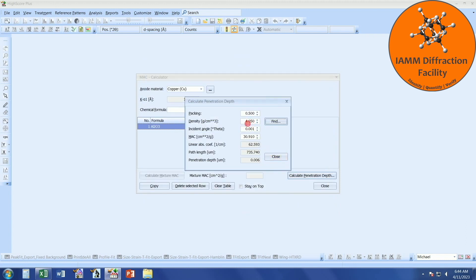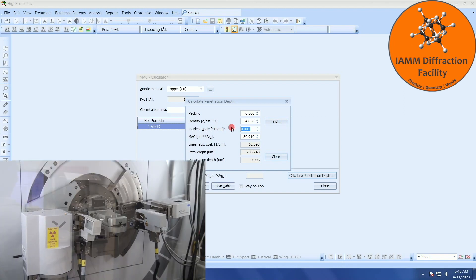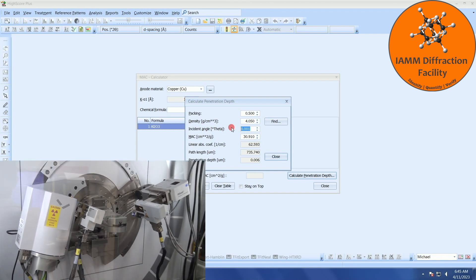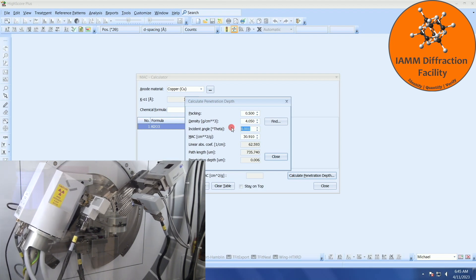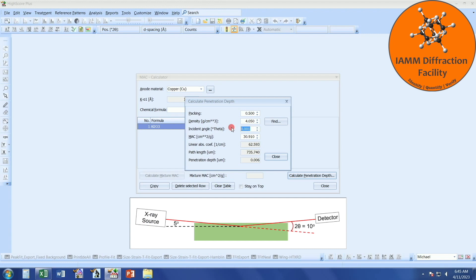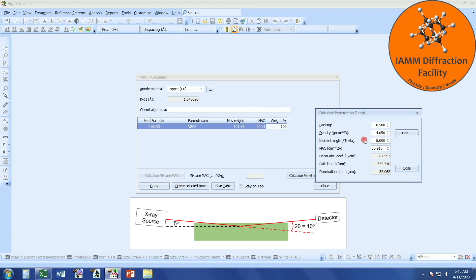The last thing we need to enter is the incident angle in degrees theta. For a goniometer experiment, this will be half whatever your 2-theta value is. This will change from the beginning of your experiment all the way through to the end. Let's pretend that we collected data from 10 to 90 degrees 2-theta. Starting out at the very beginning of our experiment, our incident angle will be 5, which is half of 10. The mass absorption coefficient we simply get from the previous calculation here that the software made, and this auto-populates.